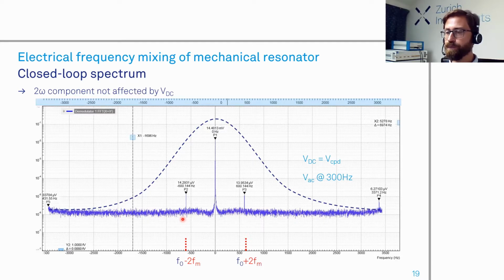So here's something worth to mention is that all these peaks will have to lie within this natural bandwidth of the resonator, and so that gives some constraints. So you can't just have arbitrary modulation frequency or much larger modulation frequency because this will actually decrease the signal strength. And if you have rather low modulation frequency, then you are limited by the demodulation speed because everything is counted over a small frequency span.